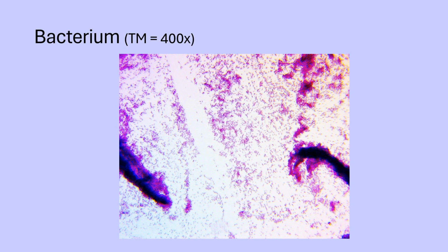So we have quite an extensive library of prepared specimens. We have things from certainly animal and plant specimens to look at, teaching anatomy and physiology. We have a lot of tissue samples, different types of cells, from skin cells to muscle cells, etc. But in addition to that, we have whitefish eggs, cells going through mitosis. In microbiology, we tend obviously to look at even smaller things. So we have fungal cells, we have cells of protists, which are typically unicellular eukaryotic cells, and then down to bacteria. Now, do we have slides of viruses?